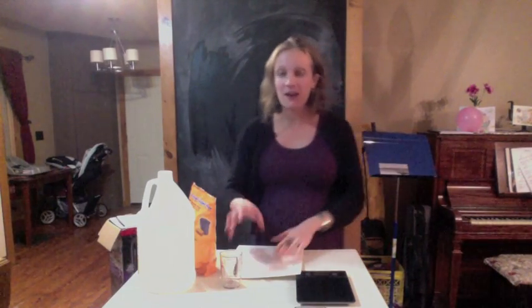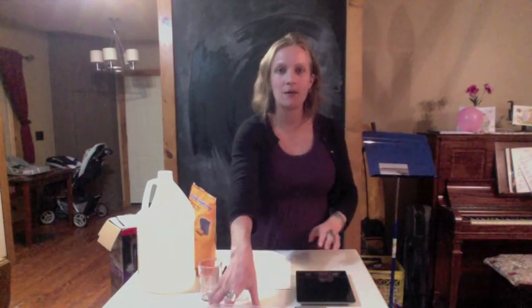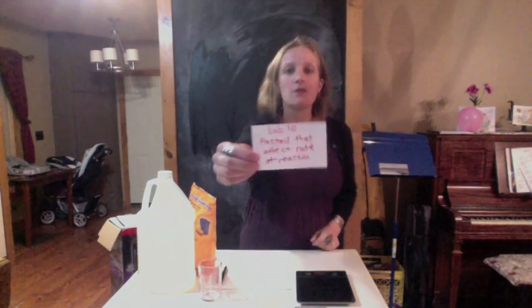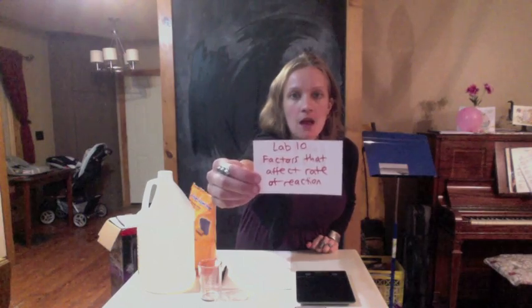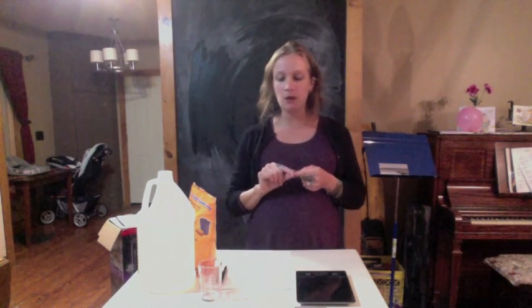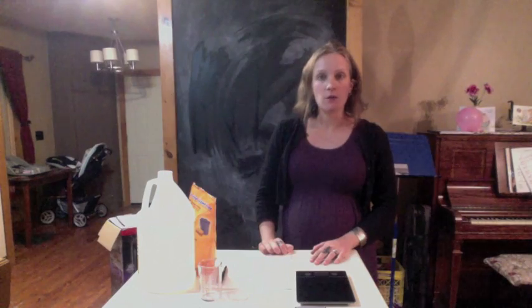Hello. Okay, so today we're working on lab number 10, which is factors that affect the rate of reaction. And we're discussing 4 major factors, one being concentration, which is how much of a chemical is in a given solution. We'll be exploring that and how that affects the rate of reaction. The next is temperature, and then we have a catalyst, as well as surface area. So let's start right off with concentration.